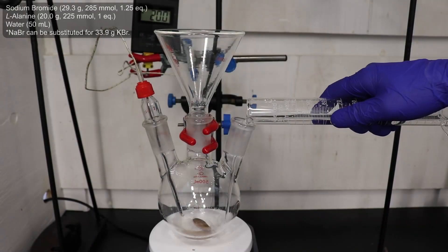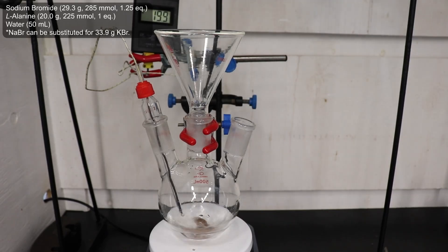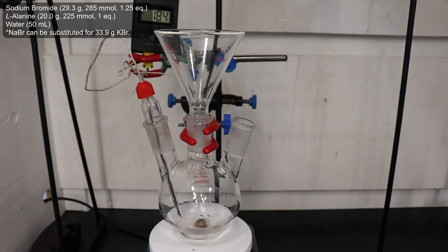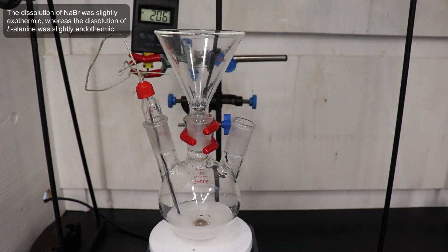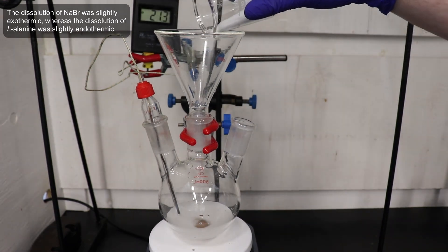To begin, I set up a 3-necked 500 mL round-bottom flask with a stir bar and thermocouple probe. To this, I add in 50 mL of water, 29.3 g of sodium bromide, and 20 g of L-alanine.